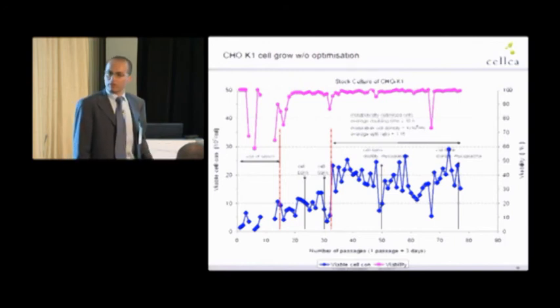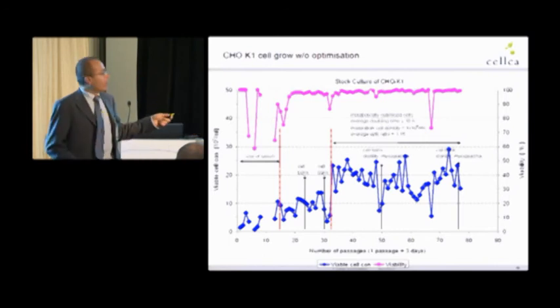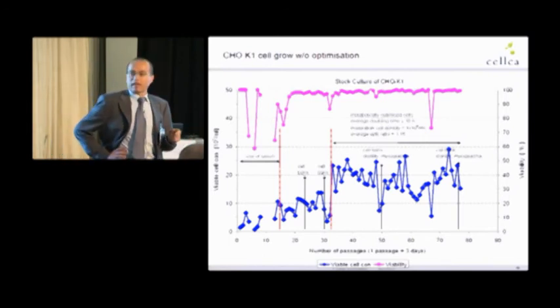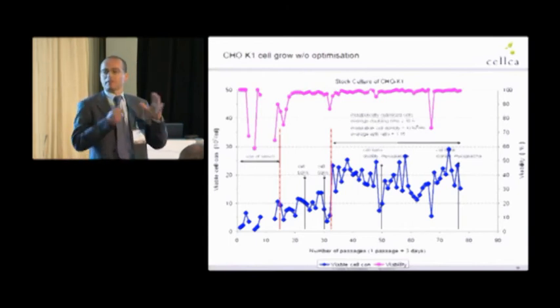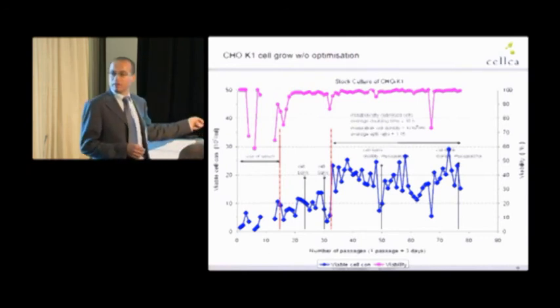I would say not. There is a change. And the metabolism of the cells there and there is very likely different. And if you fix your process with a certain medium, your medium might not be suitable for that clone there instead of there.